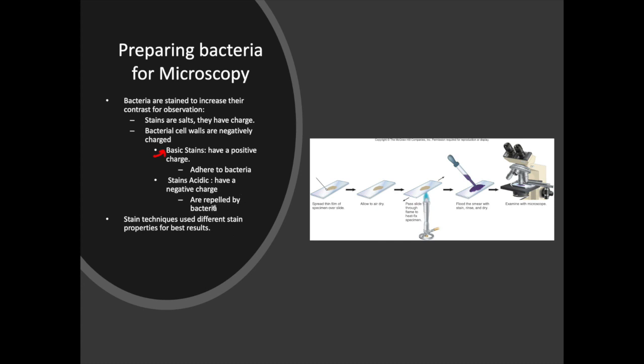If I want to look at the background, but not necessarily stain the cell itself. Remember, these guys are really tiny. So if I start adding layers of stain to the bacterial cell, I can very quickly and very easily alter the outside of it with that stain. So there are occasions where I can use a stain to mimic what we might see in Darkfield microscopy.